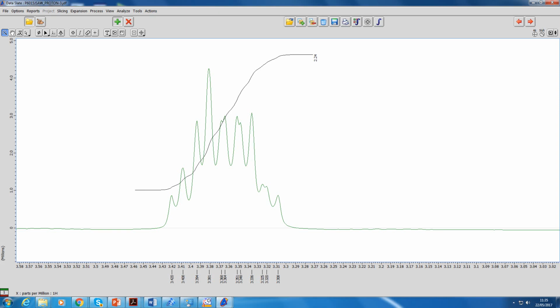I've got propylene glycol, sometimes called monopropylene glycol. Let's see, if you want to overlay it, say with the spectrum of dipropylene glycol, it's the same molecule, but rather than the OH, you've got an ether group and it links to another propylene glycol.